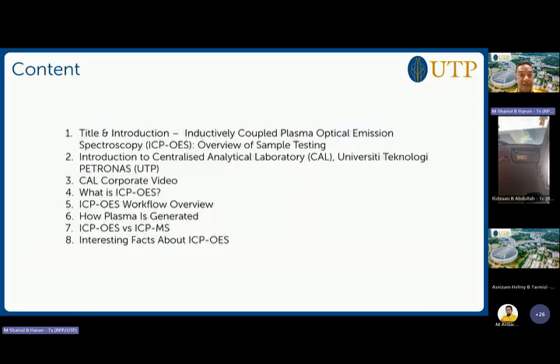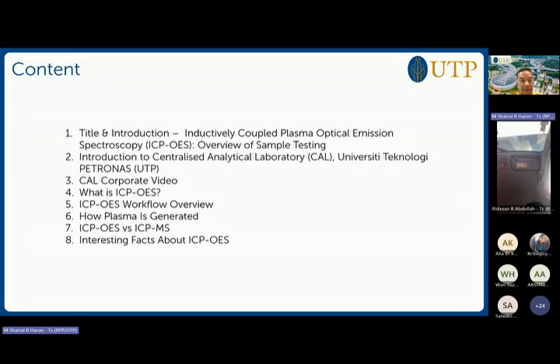Today, the title will be ICP OES, or inductively coupled plasma optical emission spectroscopy, an overview of sample testing. I will introduce you to Central Analytical Laboratory, UTP, and then we have our CAL corporate video. Then we go straight to what is ICP OES, and the next title will be an ICP OES workflow overview.